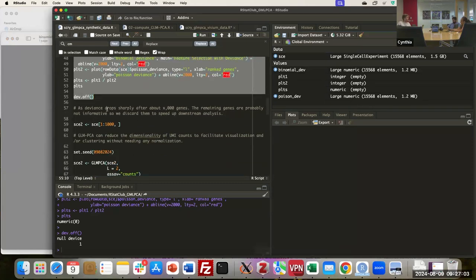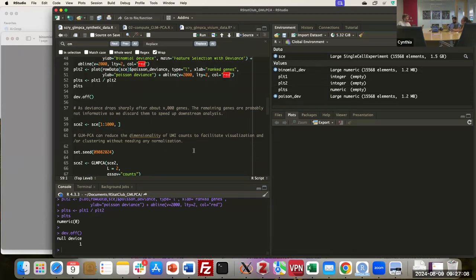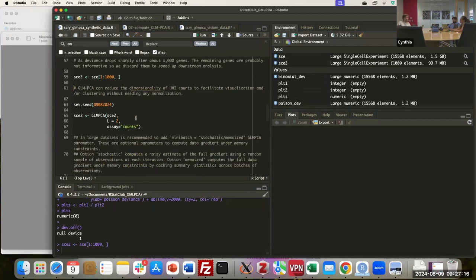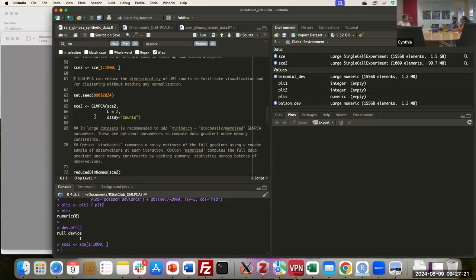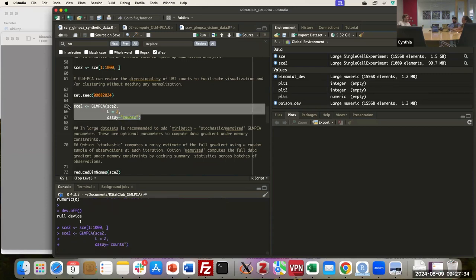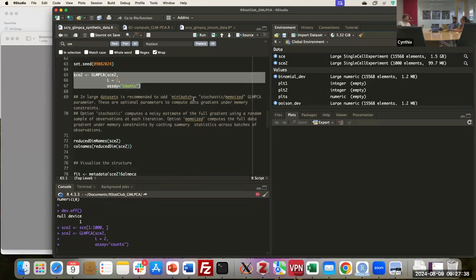I see that around the first thousand genes the deviance drops, so I'm going to make a subset of those genes and use them to perform dimensionality reduction and visualization. I'm using this subset of the model with two latent factors in the assay. An important note is that for large datasets, there's an additional argument called mini-batch — you can use either stochastic or memoized parameters to let the model handle the data in batches. These are optional parameters to compute the gradient under memory constraints.